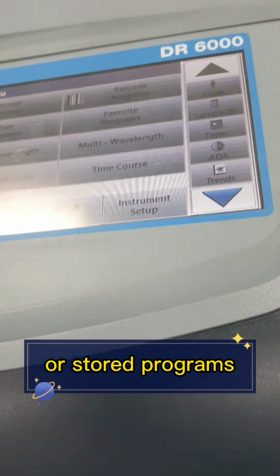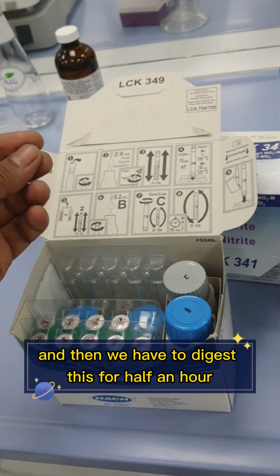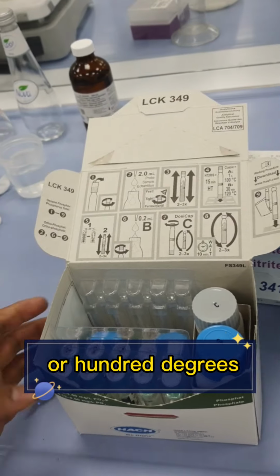For doing phosphate ions, first of all, we have to take out the kits. Okay, these are kits here, and these are also kits, so we have to follow the procedure which is printed on the inside leaf, or you can say the page. So we'll just be taking it out and removing the cover, and then we will be adding 2 ml of the sample, and then we'll be shaking it, and then we have to digest this for half an hour at 120 degrees C or 100 degrees C for 1 hour.